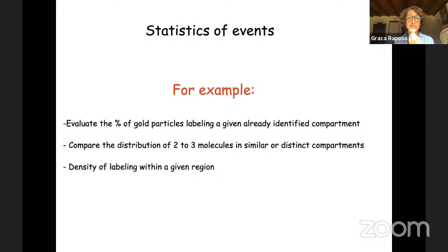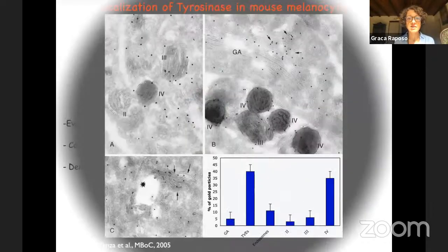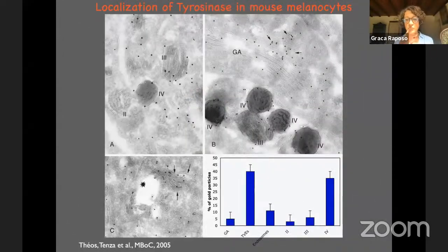Again, I cannot insist more on the fact that we need statistics, we need to do image analysis, because we cannot only show the example of one micrograph in a paper. The reviewers always ask for statistics, and this is just one example from one of our papers. As you'll see in most papers using these techniques, there are a lot of methods to do the quantification of the gold, even under the microscope or now just on the computers: you take different images and you just count.